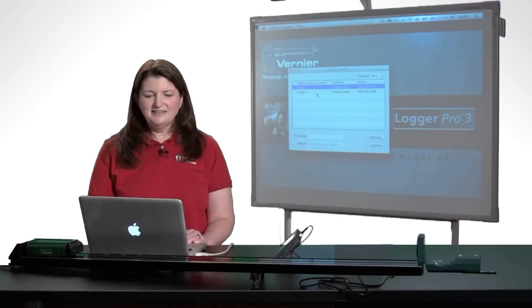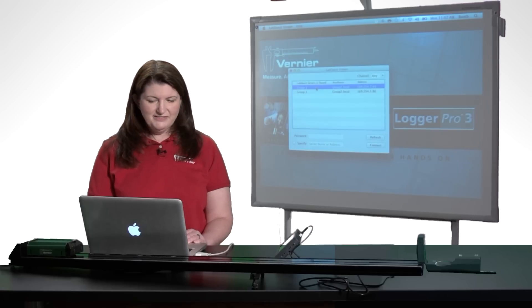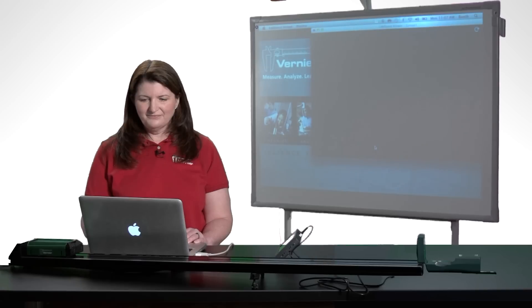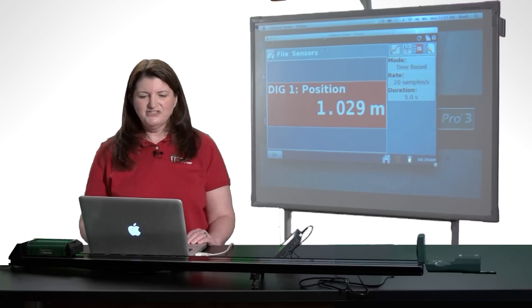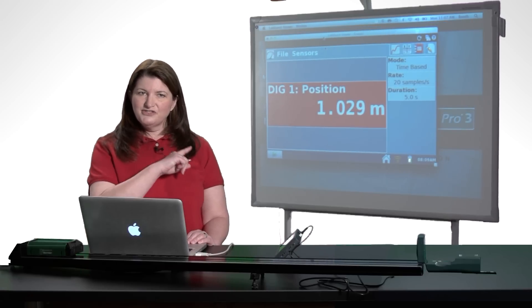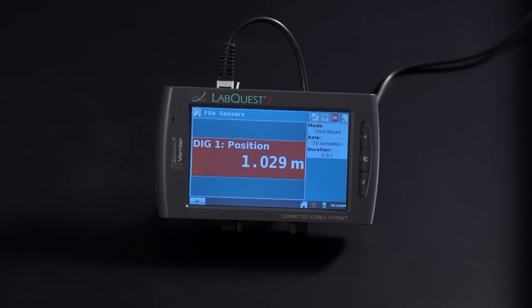When I do that, I see a list of available LabQuests and choose the one I want to see. Group 1 is the one I'm using right here, so I just say Connect and there it is. I have my LabQuest screen displayed on the projector screen and on my computer. The same screen you're seeing in real time is on the LabQuest 2.